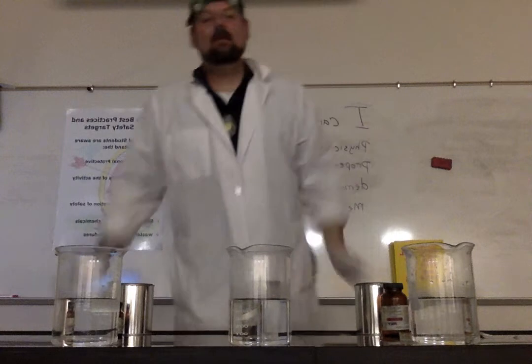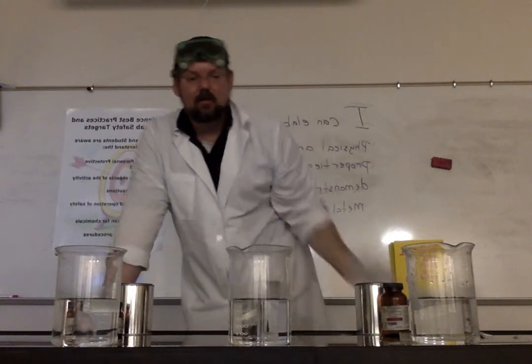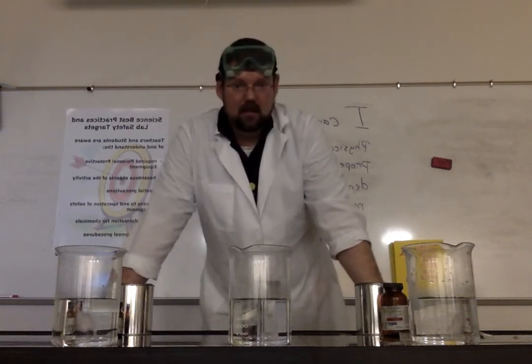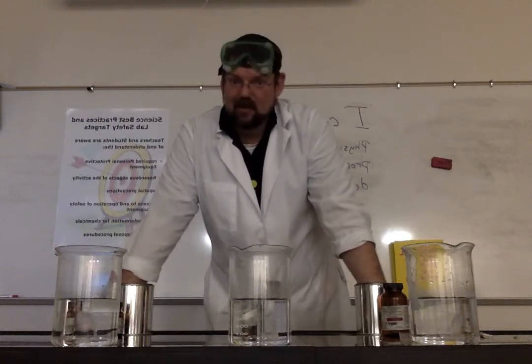This buffer is 8 feet. So you have 8 feet from your line to the front of this counter. And then if something were to happen to me, then you have another 3 feet to be able to get to me. This is because I don't want you touching me or anything else like that if something does occur.